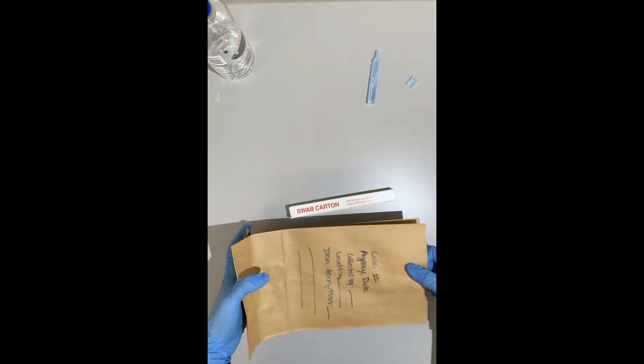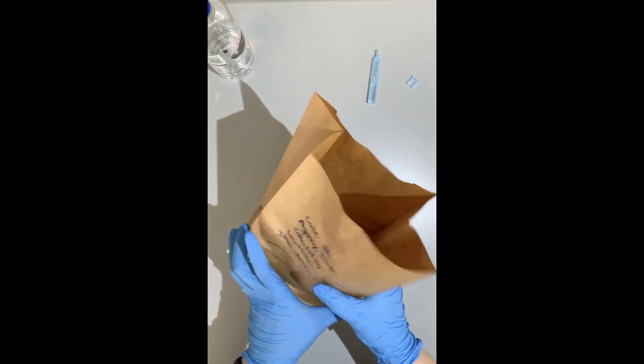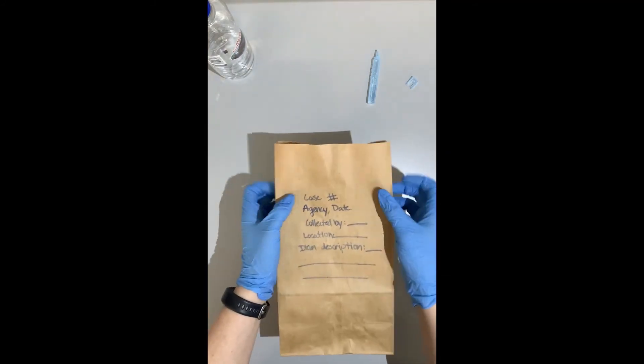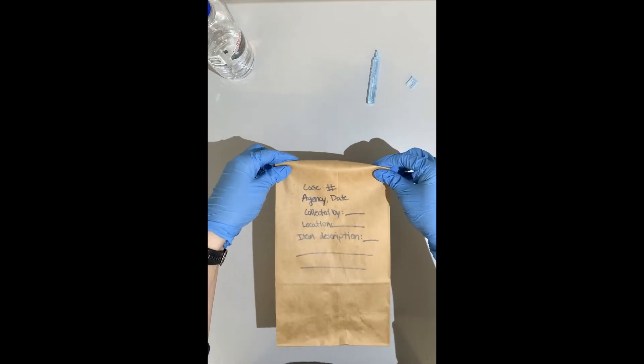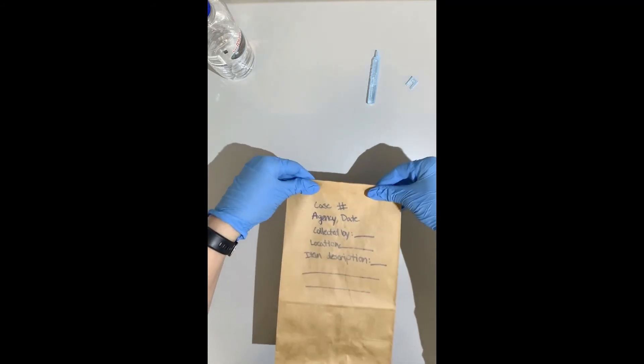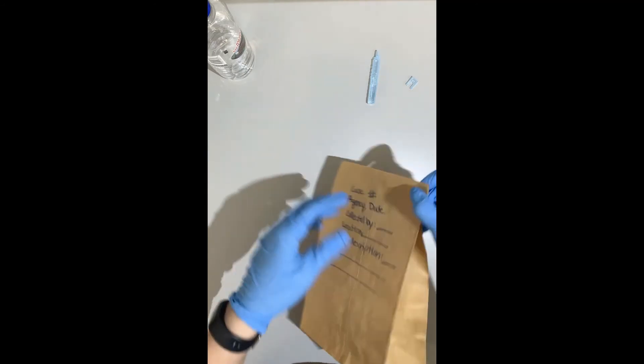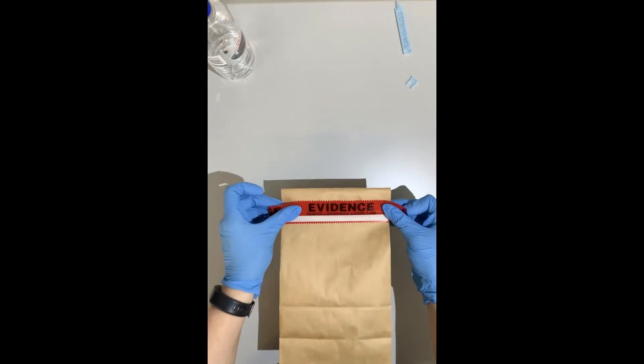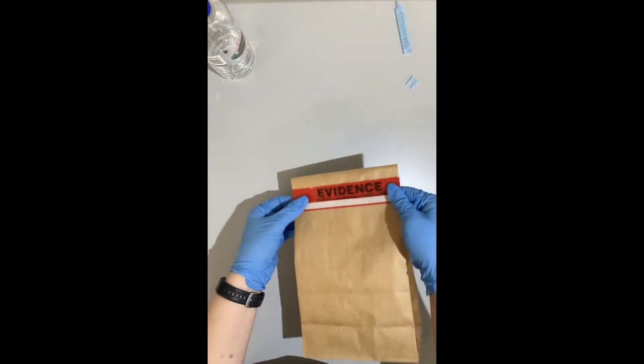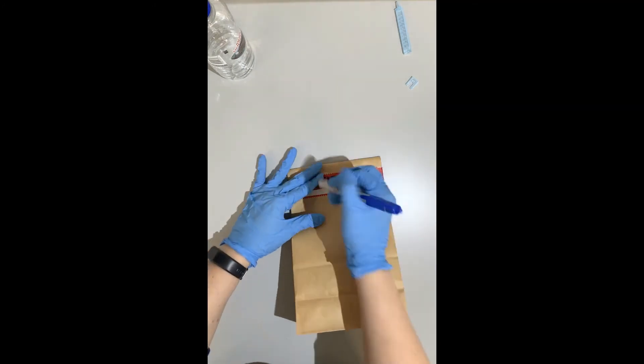We've got our evidence bag that has been labeled with our agency case name, our case number, my name, and we'll place it inside of our brown paper bag. And then the same thing, we want to fold this top down, making sure that none of the front information has been affected, get a piece of evidence tape, close it up, wrap around the sides and initial.